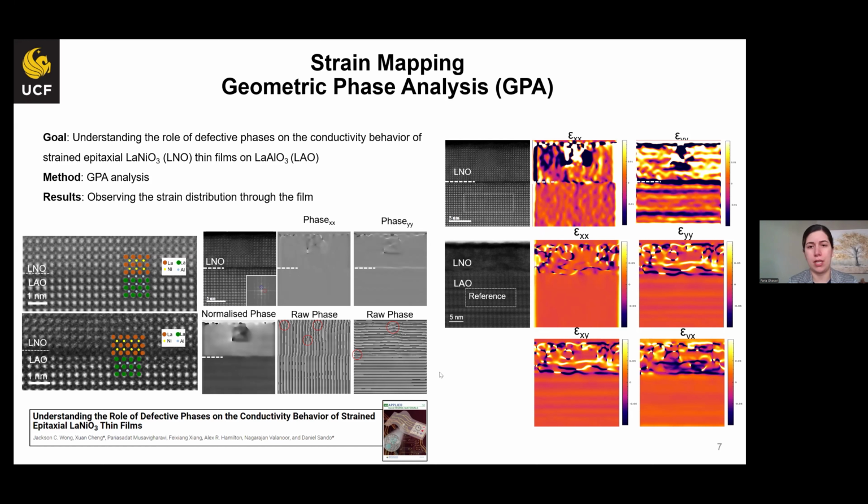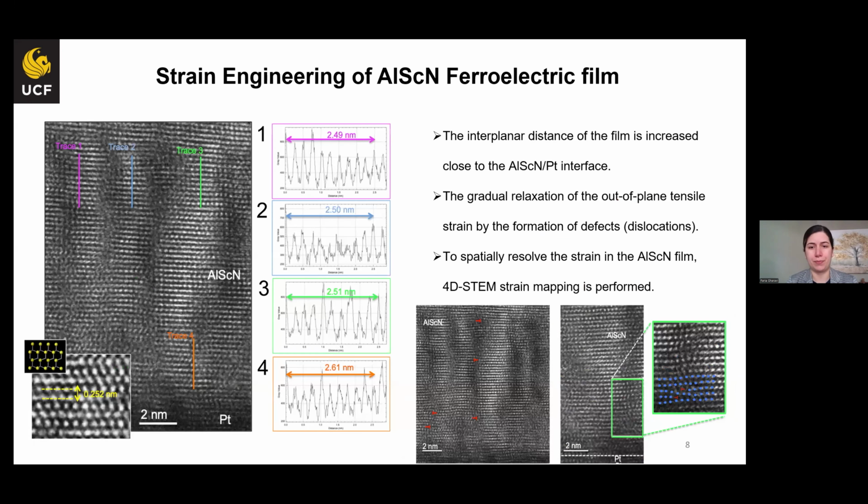So we had LNO film on top of LAO film, which is a ferroelectric material, and using GPA software, we could analyze and study the strain in two different directions. However, it's not very accurate. And if we are looking for a technique which is very accurate to give us the number, we should use other techniques like 4D STEM.